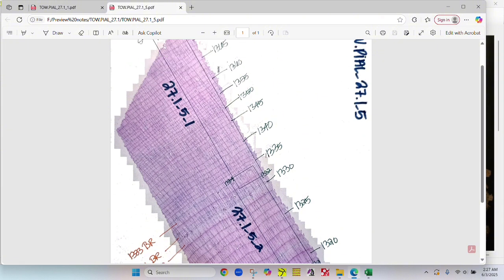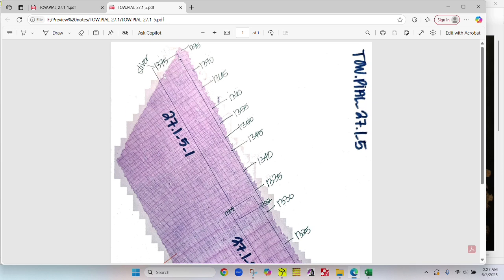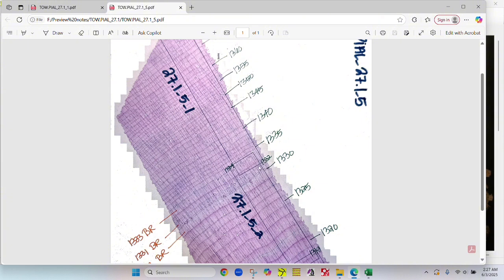And then I date them. I usually go by increments of 5 years because it's easier to look at when I'm also going through and finding out what year this image starts with. So this would be the outermost partial year. And I also sometimes put notes to let myself know that I am counting this little sliver here, and that's when I need to input 1375 and make sure that I create a ring boundary here. All the way down to the innermost partial ring, which in this case for this first image, _1, would be 1332.